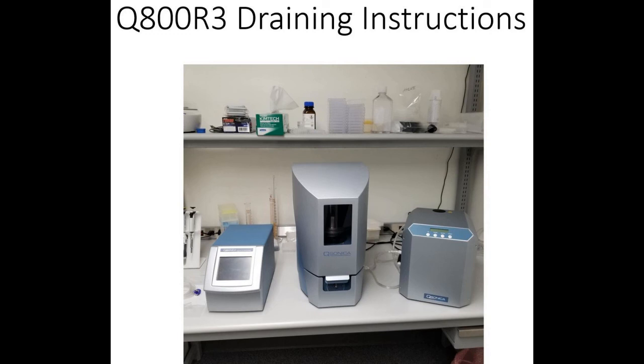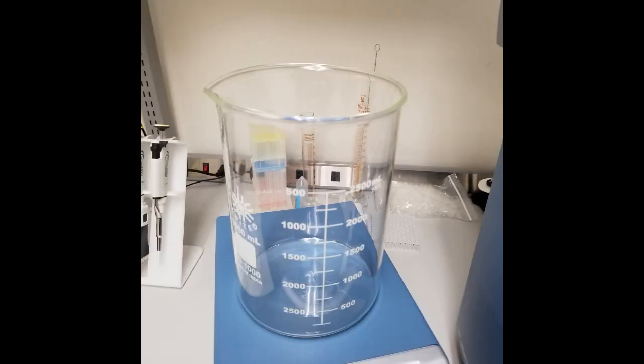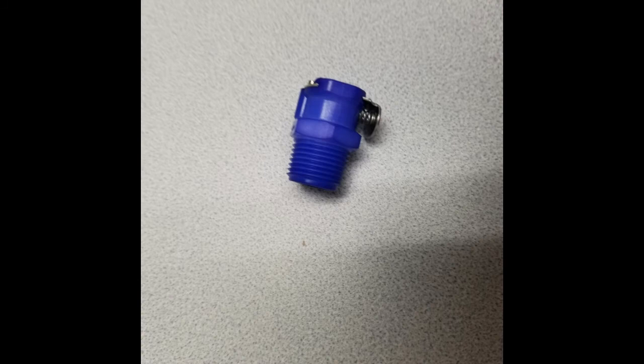To begin draining your Q800R3, you will need a 2-3 liter container to empty the water into. You'll also need the blue drain fitting, the coolant drain tubing, and some paper towels.